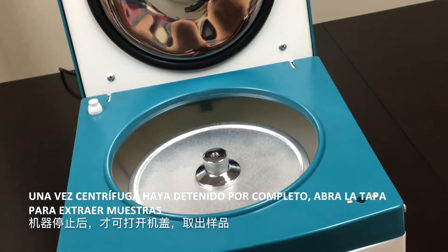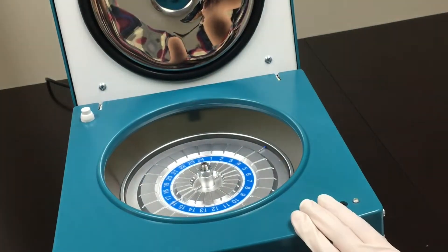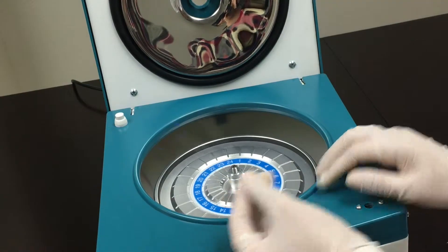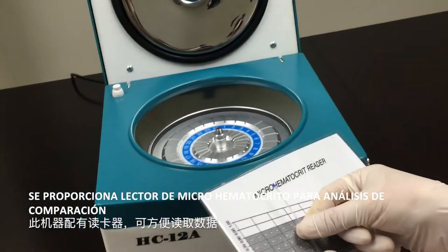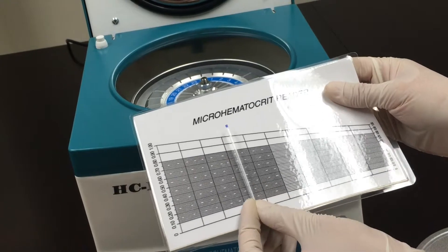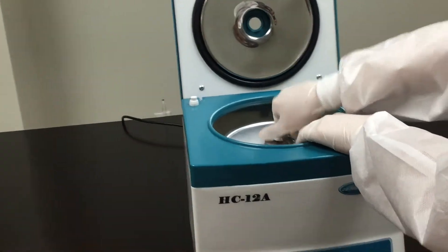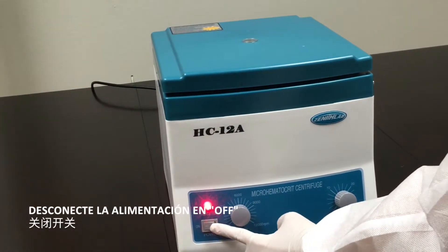Once the centrifuge has completely stopped, open the lid to remove samples. Make sure to close the rotor cap and lid once the device is no longer in use. Turn the power switch off.